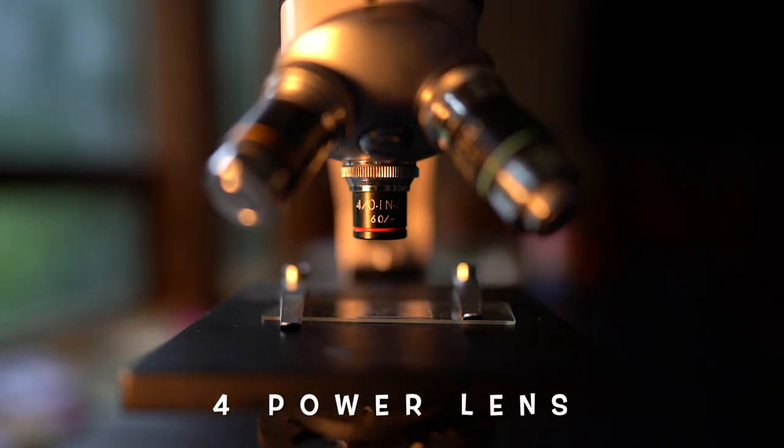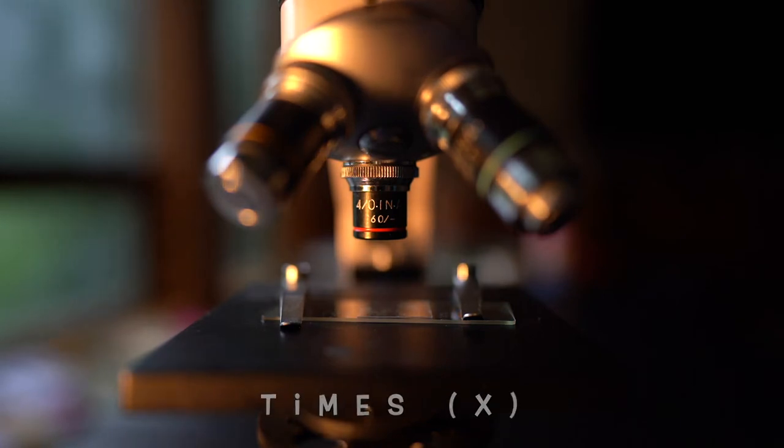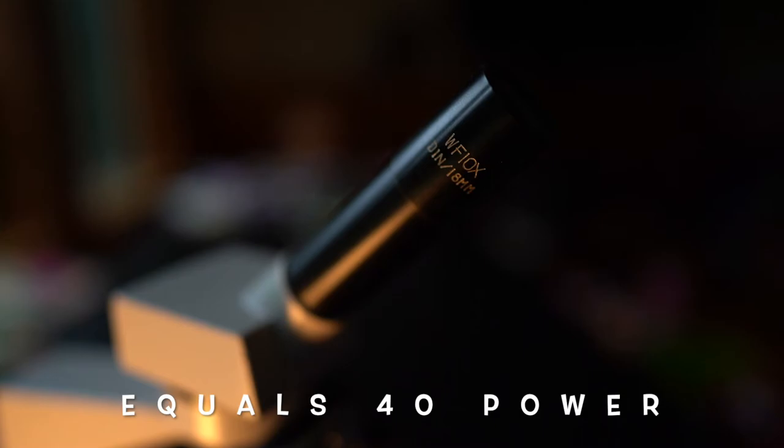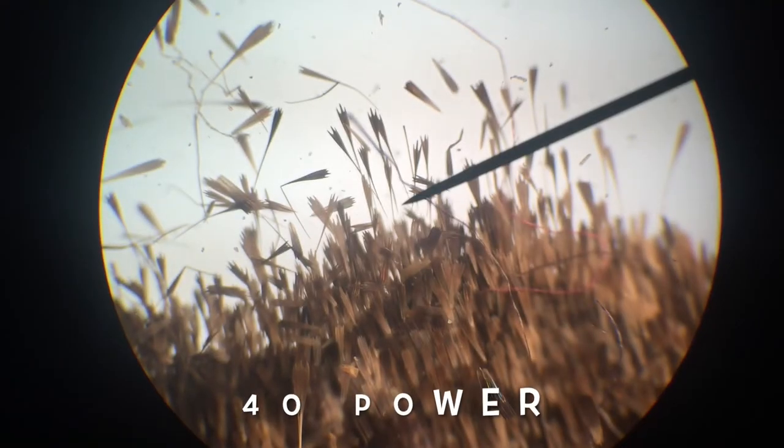To figure out how strong your field of view is, you'll take the lens, which is in this case 4x, times it by the eyepiece, which is 10x. 4x10 equals 40 power. So your field of view here is zoomed in 40 times.